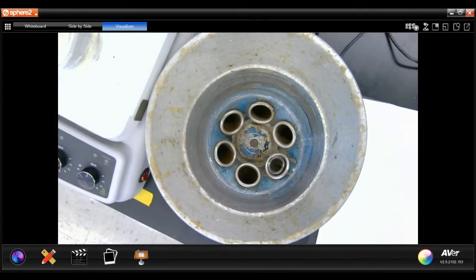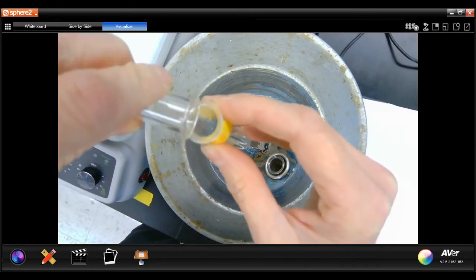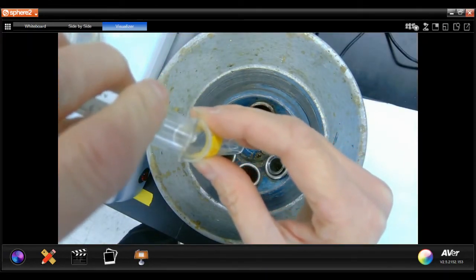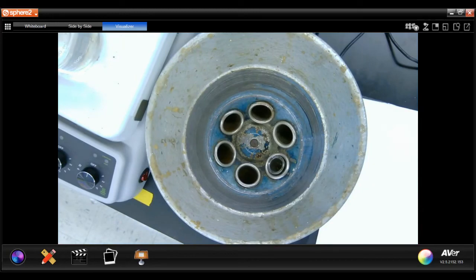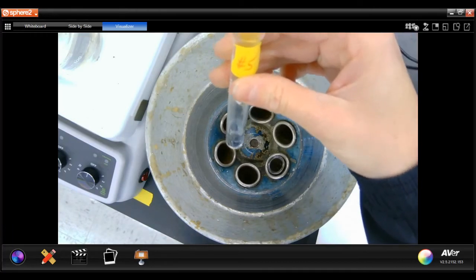Now I'm going to separate the solution from the precipitant by decanting. I'm going to save the solution for procedure number five — I have it labeled — so I'm going to save that for procedure number five.